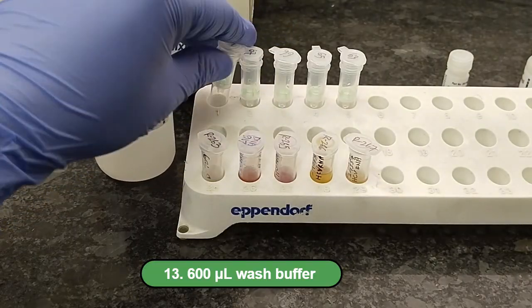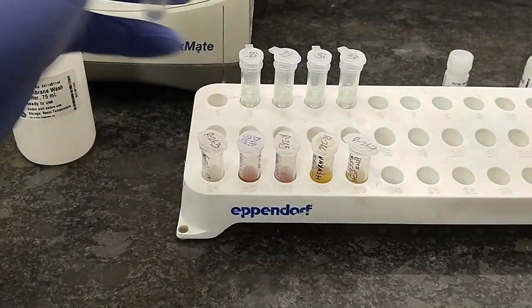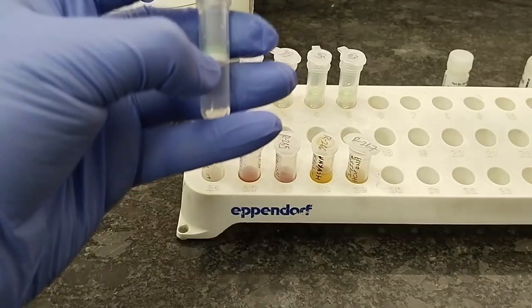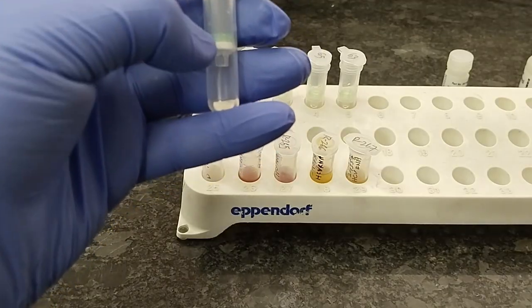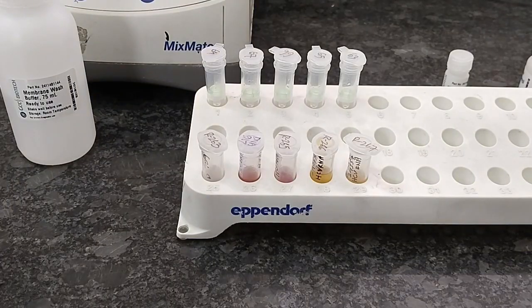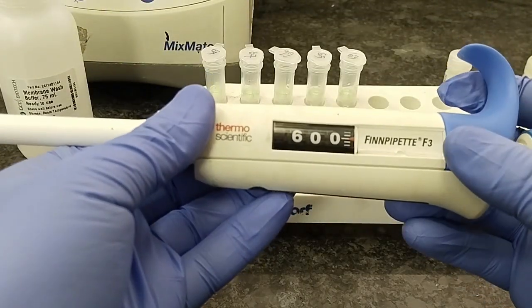But it cannot remove the RNA. Once RNA gets attached to the membrane in the column, it cannot be separated until we use elution buffer. So add 600 microliter membrane wash buffer, and this washing step will be repeated two times.